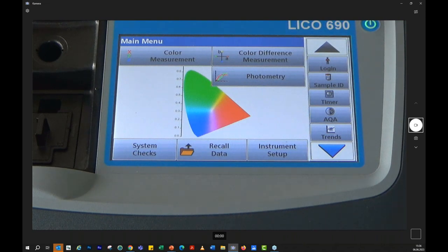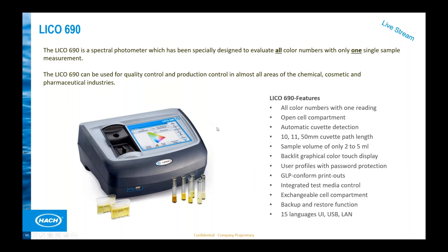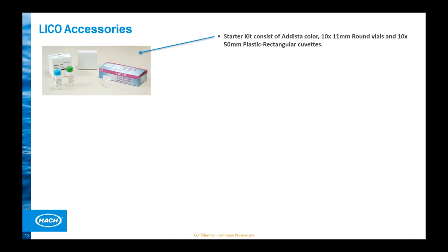In interest of time, I would say this is so far the most important thing to have a look on, these most important functions of the LICO. And now we are going to return to the PowerPoint presentation. So this is what we already have seen. So I would like to use the rest of my part here during this WebEx conference, the webinar, to have a look on the accessories visible here.